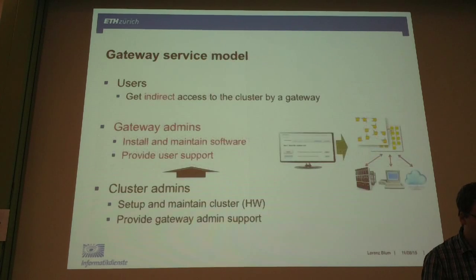So for a specific group, the Aebersold lab, which is a proteomics lab at ETH, we have introduced a new service model, this gateway service model. We put in an intermediate layer, a gateway, between the users and the cluster.